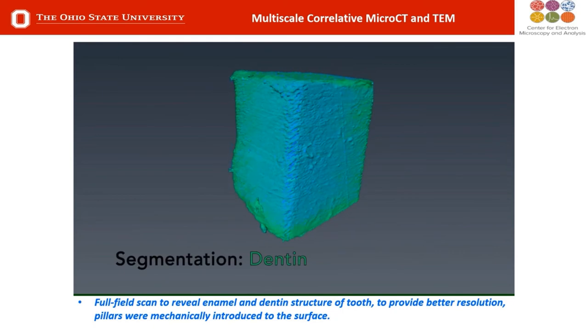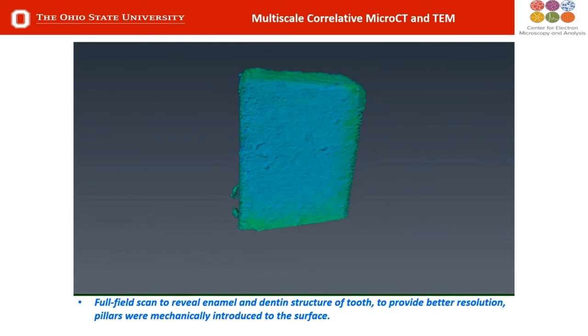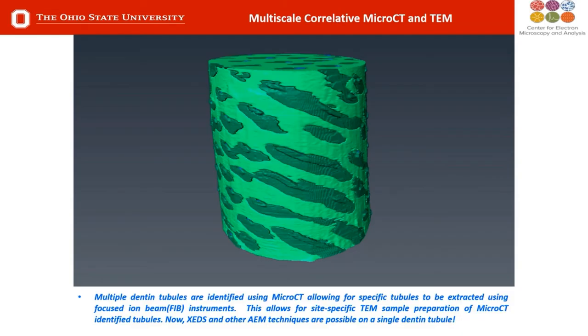After doing this, we can actually see where the dentin tubules are. Now, these tubules run directly towards the nerve of your tooth. And so what we need to do is see that Sensodyne toothpaste, when exposed to them, is occluding those particles. But let's say you're working in some material that has a very tubular structure. You can imagine that flow is important, and understanding tubule interconnectivity and flow rates is important. So you could take something like this, scan, and get a nice internal picture of your pore distribution and your tubule distribution. And again, similar to what we just did here, we've modeled it.